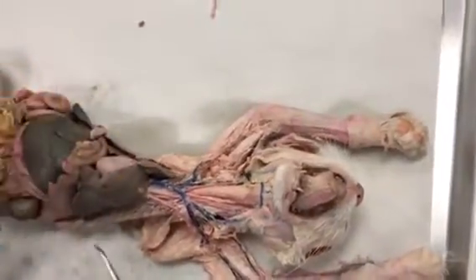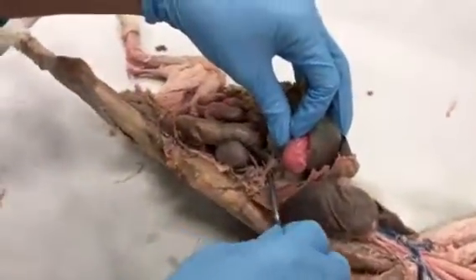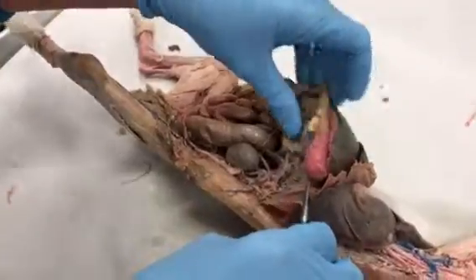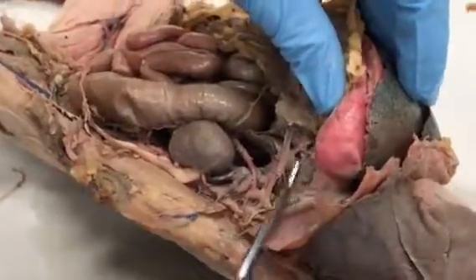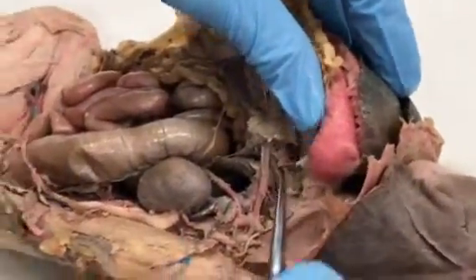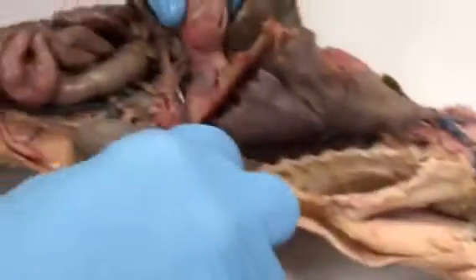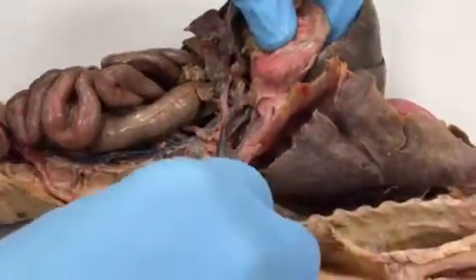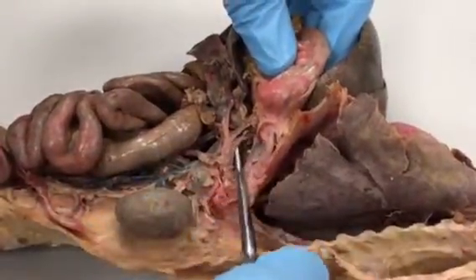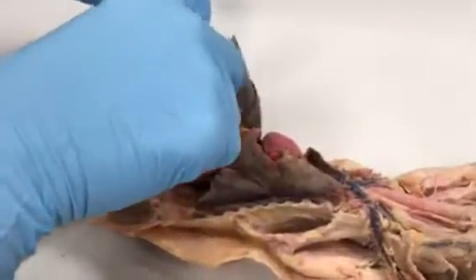All right, then as we go down into the abdominal cavity, we have the celiac artery is the first thing that we're going to see, and it has three branches: the hepatic, the gastric, and the splenic. The hepatic artery goes to the liver. The gastric, you can see here, goes straight to the stomach, and the splenic goes to the spleen. However, there's a better example on this cat, because typically what you see is the hepatic branch branching first, and it sort of goes underneath the gastric, which you can see right here is going right to the stomach. The hepatic artery goes underneath and up to the liver. Then you have the splenic artery, that branch, which goes straight out to the spleen.